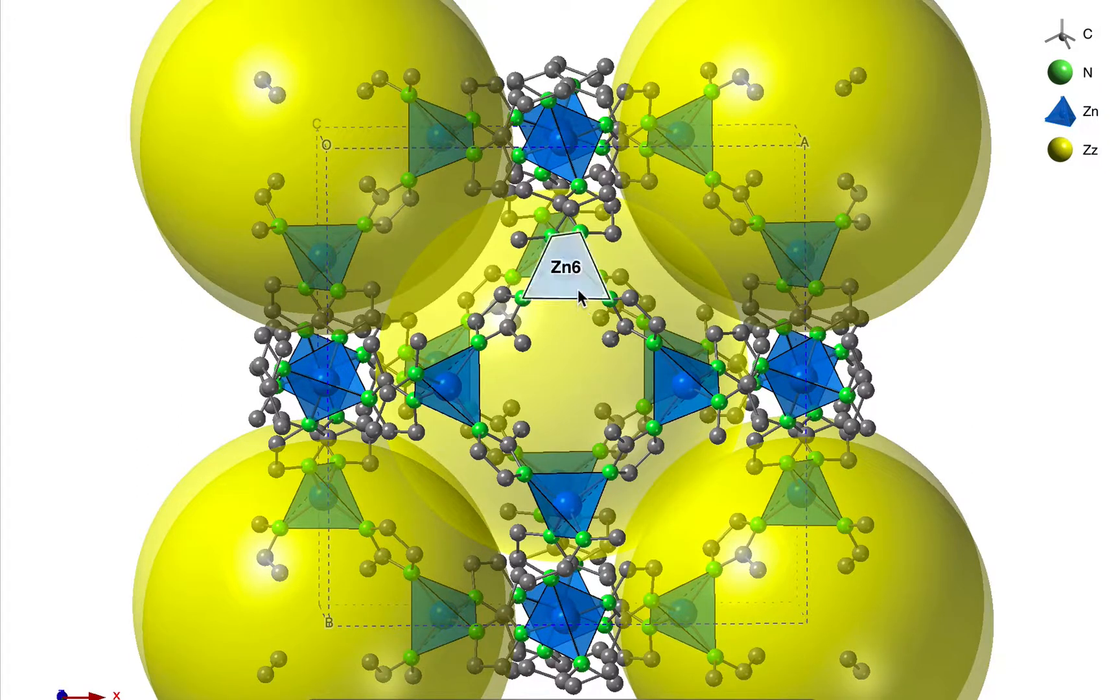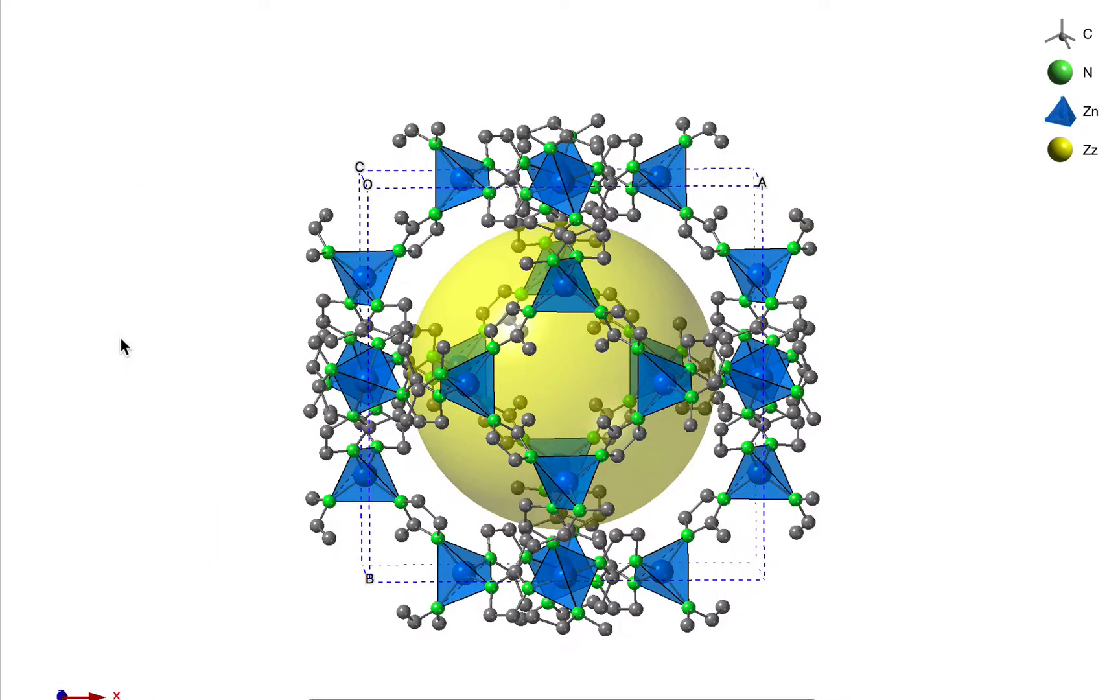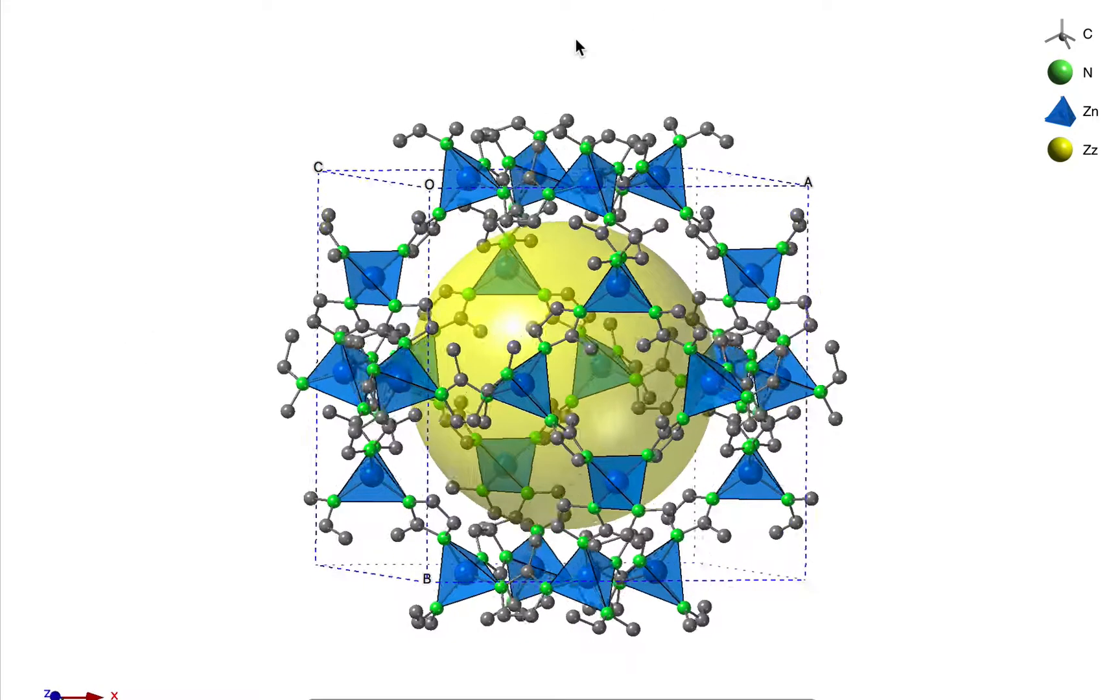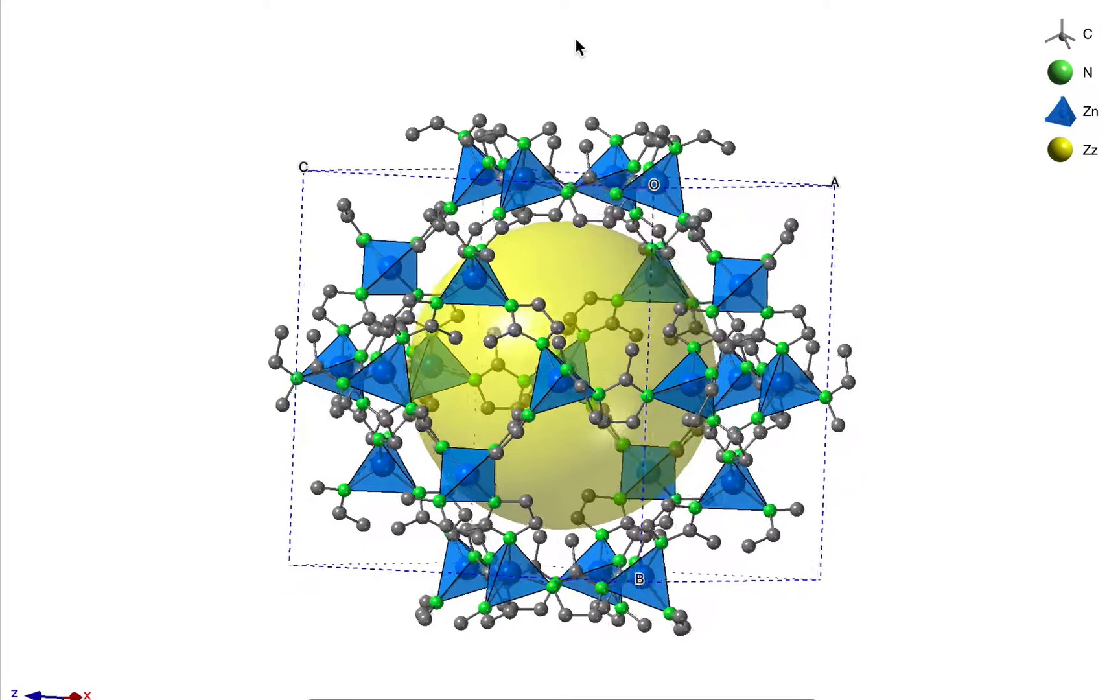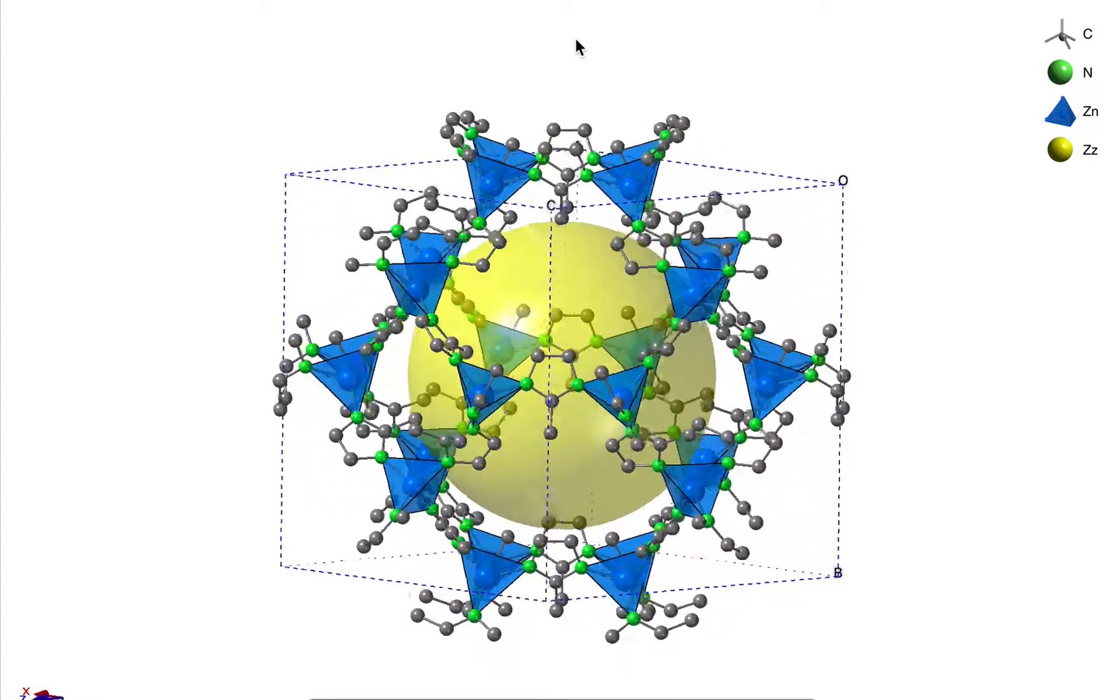I'm going to click on one atom in the framework, right-click, and choose isolate selected fragments. Now we have a nice model that shows the cage and the centroid atom inside.